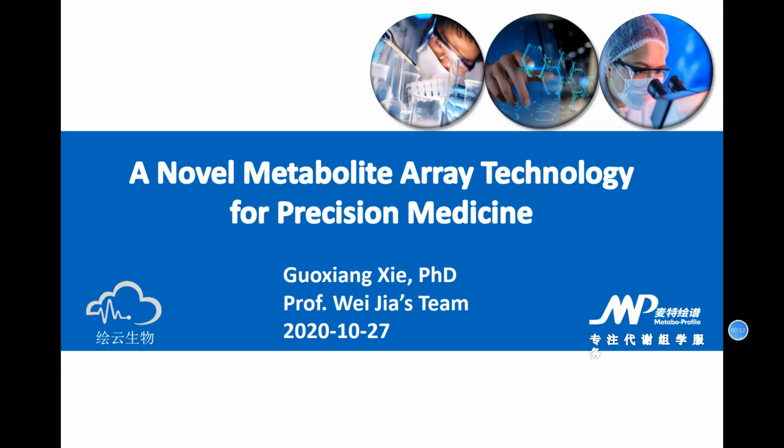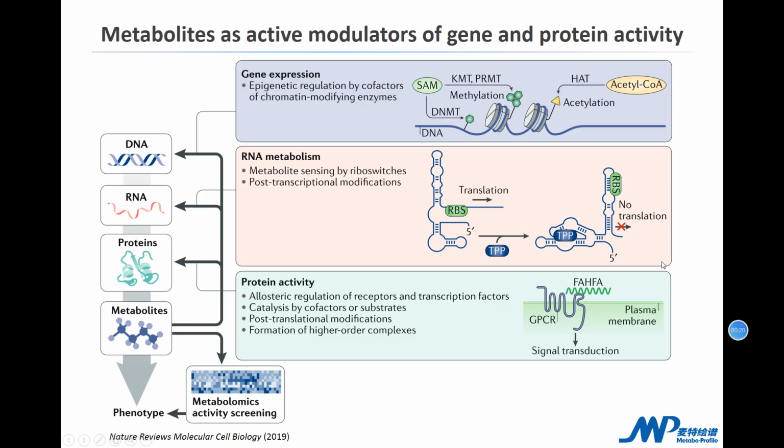My topic is a novel metabolite array technology for precision medicine. As we know, metabolomics studies the complete set of low molecular weight metabolites present in cells, tissues, and body fluids. It is an important branch of system biology.